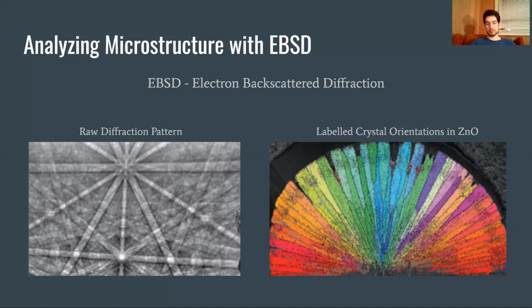The basic physical operating principle is this. When high energy electrons enter the sample from the microscope beam, many of them are scattered inelastically from the atomic electron cloud. So some of them will be scattered back towards the sample surface or escape the specimen in different directions.